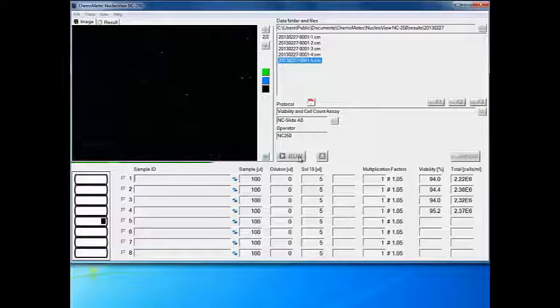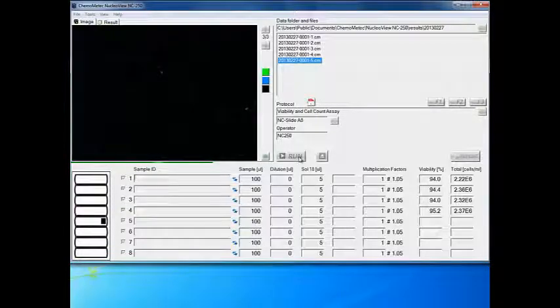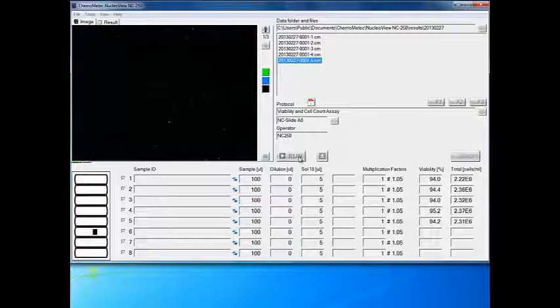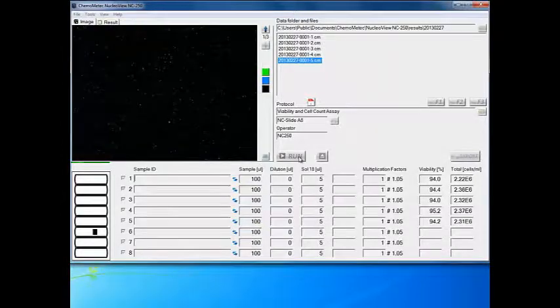The two fluorescent light sources are activated sequentially, resulting in one image with a green and a UV channel. Results are presented continuously, giving the total count and the viability.